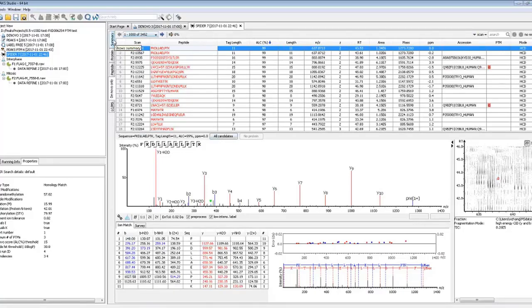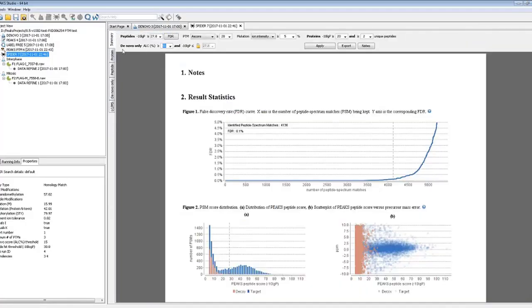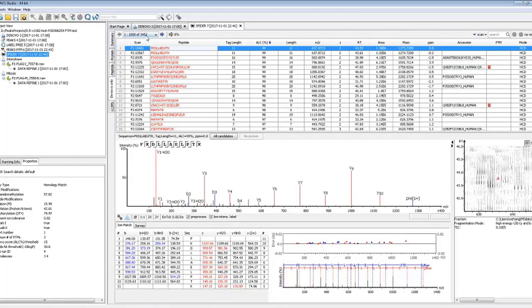You can still see that we have an ALC filter of 50 or greater, and that we still have 3,452 spectra that still have a good quality Denovo sequencing result above that cutoff. You'll notice here that these even still have really high local confidence scores at every amino acid in the peptide sequence in many cases.